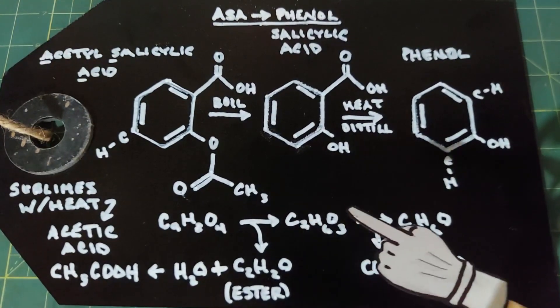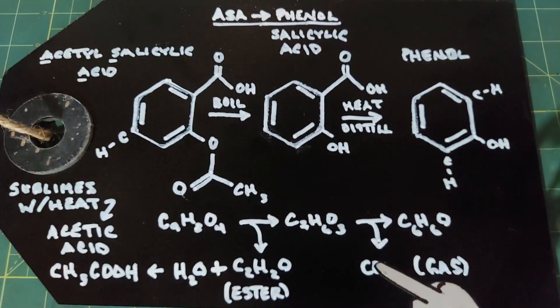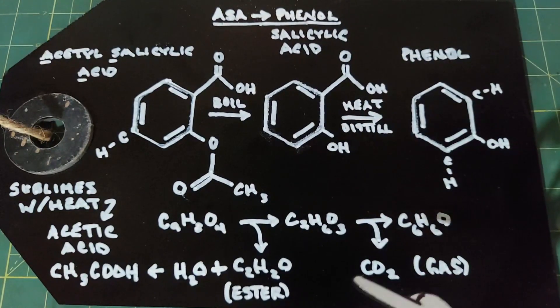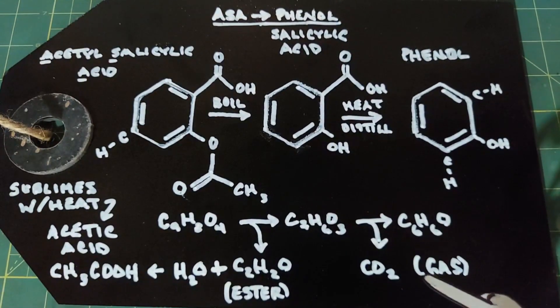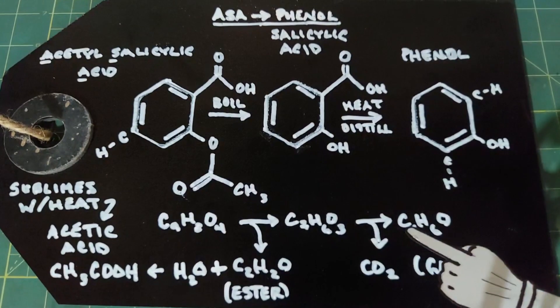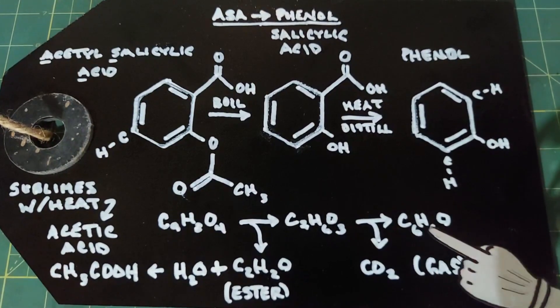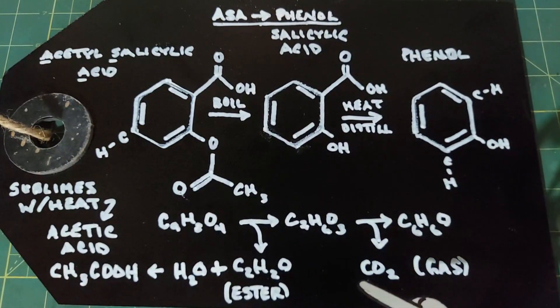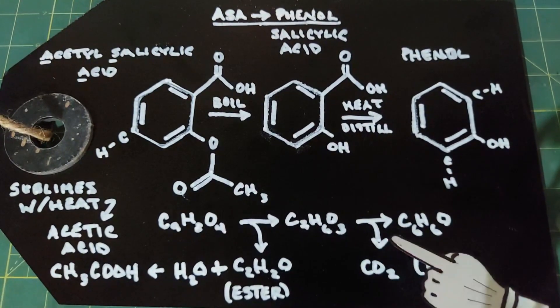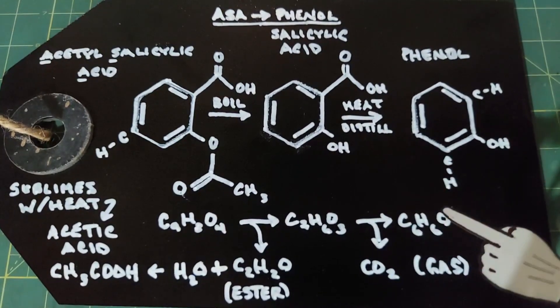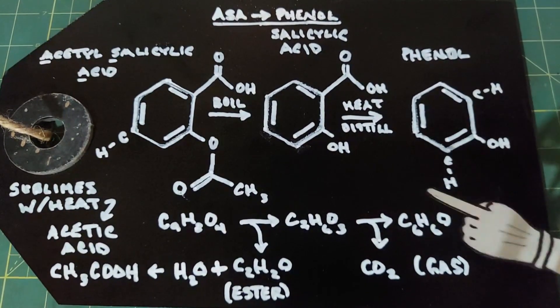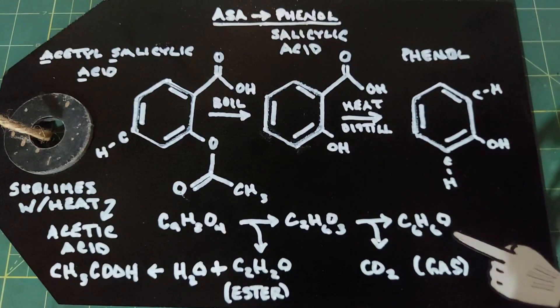We're going to put the salicylic acid in a distillation apparatus and heat it. When we do that, we're going to drive off the carbon dioxide group — this is the carboxyl group — and carbon dioxide is driven off as a gas. We're left with C6H6O. So C7H6O3, lose a CO2, and you have C6H6O. That is phenol, and that's how we end up with our product.